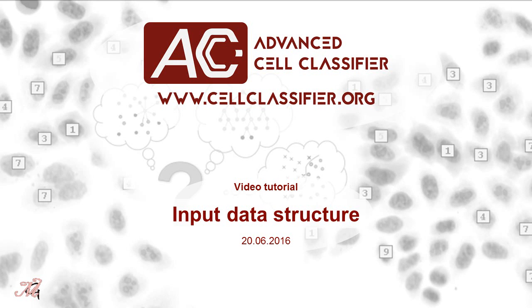Welcome! In this video tutorial, I will briefly show you how to organize your data to use Advanced Cell Classifier. I'm going to describe the most common structures supported by Advanced Cell Classifier, called standard screening structures based on image and feature files. However, other data structures are supported as well. Before running Advanced Cell Classifier, please read the help documentation file of the software.